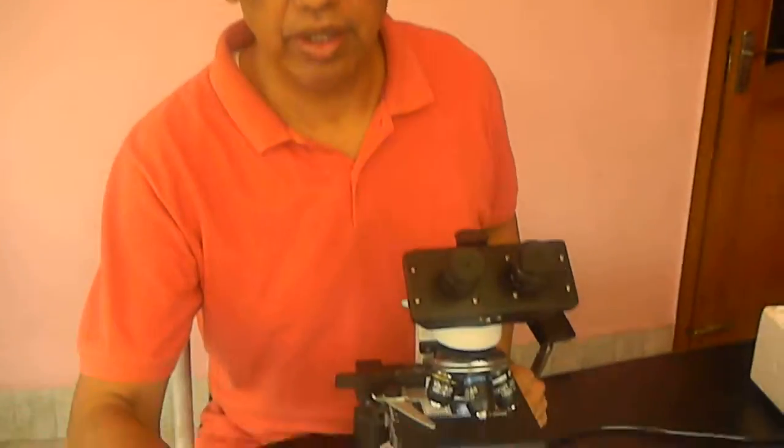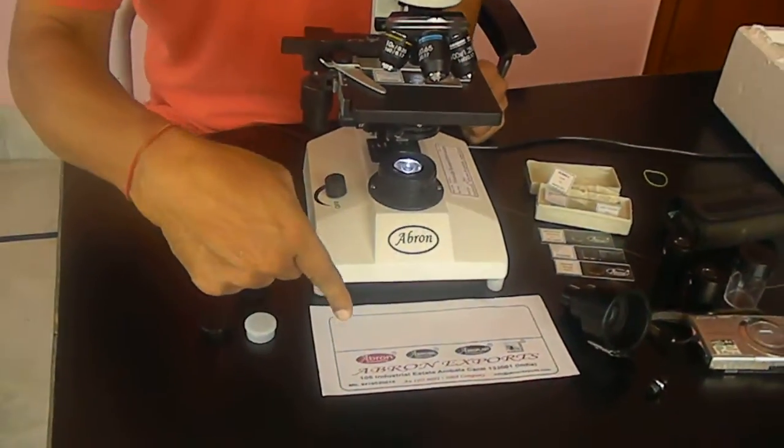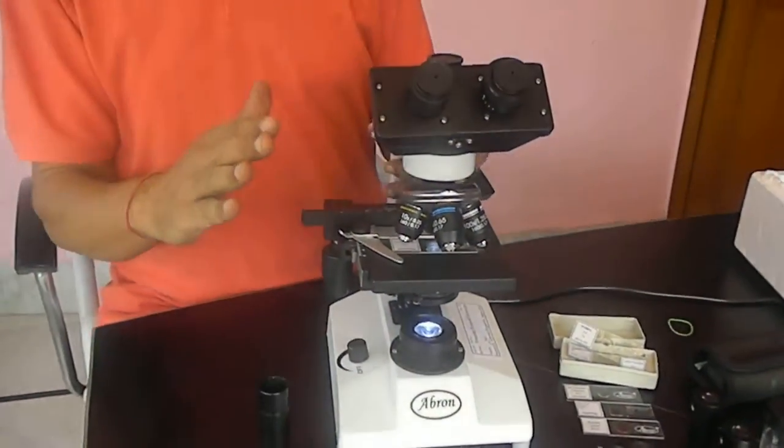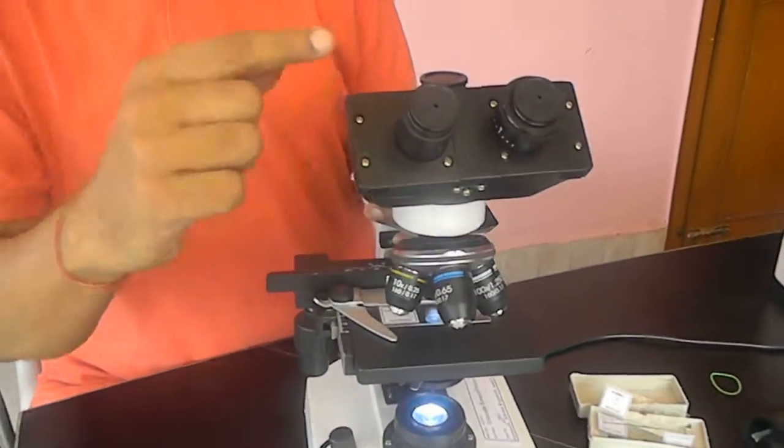Trying to understand the use of the trinocular microscope digital with a camera made by Abron Exports. We have a microscope which is a trinocular microscope.